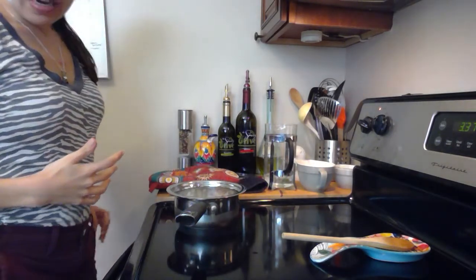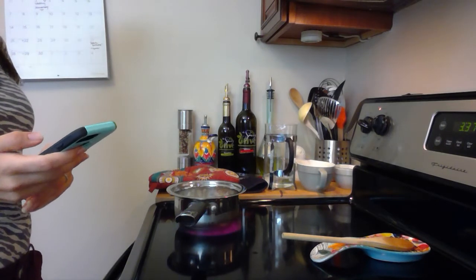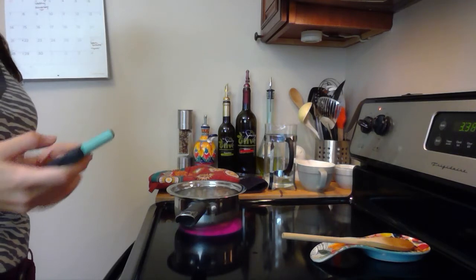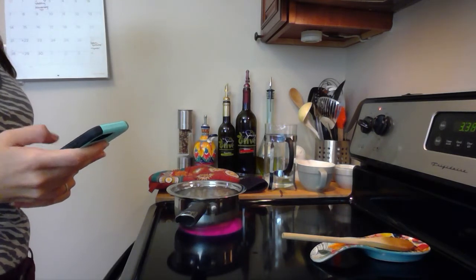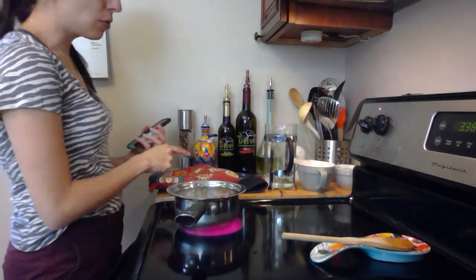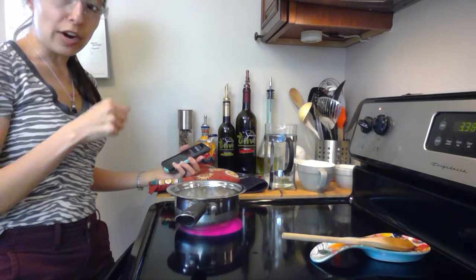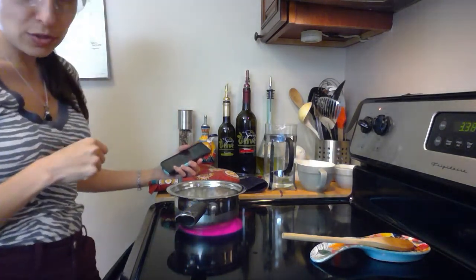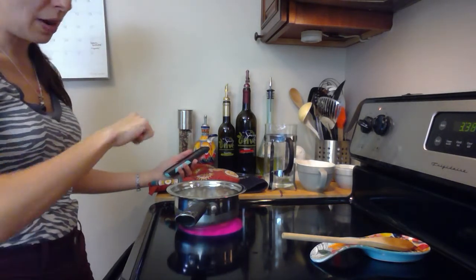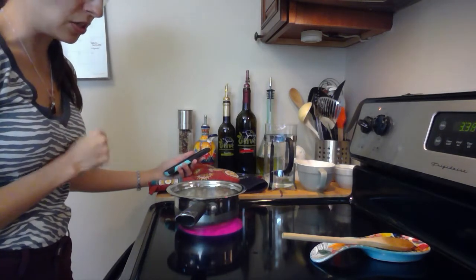Now every 2 minutes, you're going to be using your thermometer to take your temperature. So I'm starting my 2-minute timer. I'm using a cell phone. If you have an actual stopwatch, that's really great too. I'm starting my timer so that exactly at 2 minutes, I will be recording my temperature. Now it says to make sure that you're actually stirring for about 10 seconds before you take the temperature. So when I notice that I'm almost at my 2-minute mark, I'm going to grab my spoon and stir. And I'm going to go ahead and take my temperature after it's all been stirred uniformly.